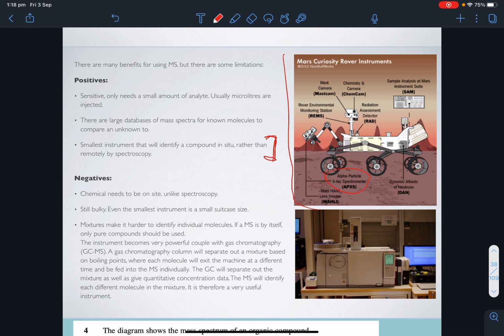And it forms this instrument here that I've got a picture of, and this side's the mass spectrometer, and this side is what we call a gas chromatograph, okay? And gas chromatography. Chromatography, remember, is a separation method. There's lots of different chromatographies. Here we've got it in gas. So what's happening on this side is we inject our sample as a solution, as a mixture, and it gradually heats it up. And it heats it up over a set rate.